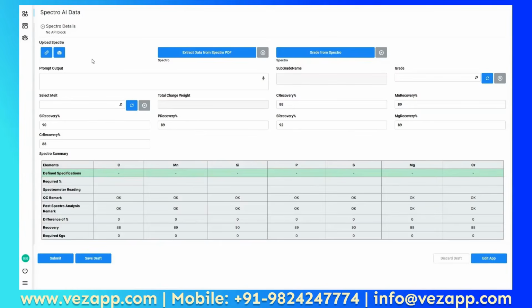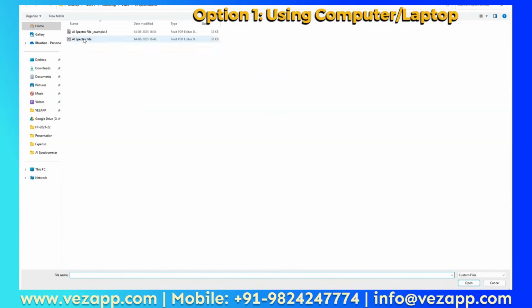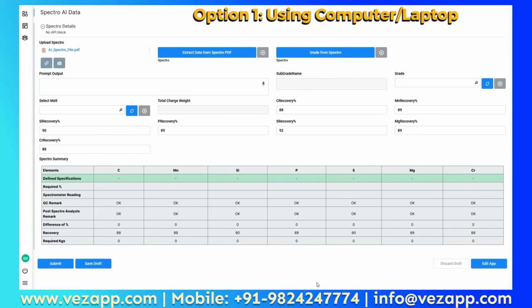I do not have a direct interface with the spectrometer. I do not have any wire cable, nothing. All I have is a print format PDF. I can just take a printout or save it as a PDF. So I'm going to just save the PDF I have. This is my PDF file. I just open it here. It's a simple PDF file with a spectrometer result, and I am going to extract data from this PDF file.